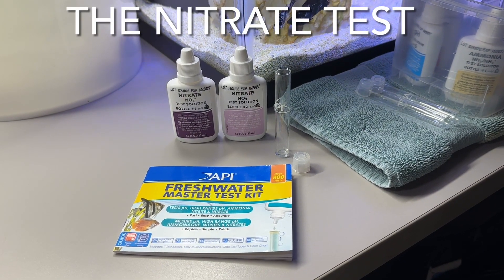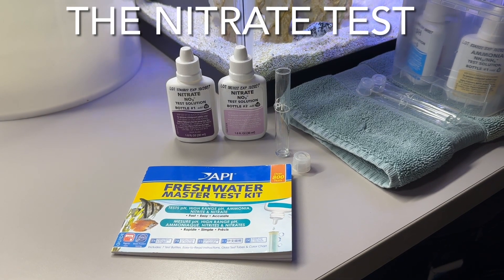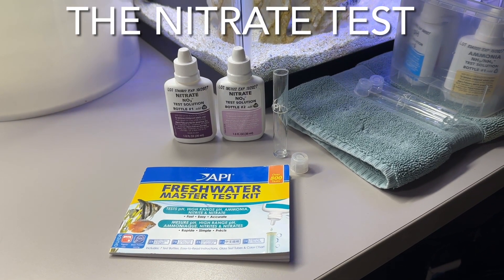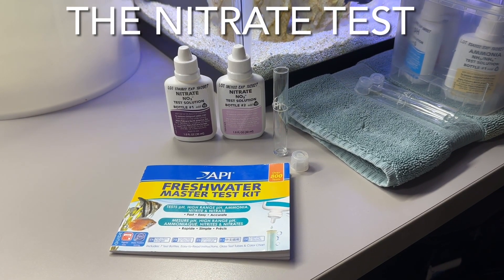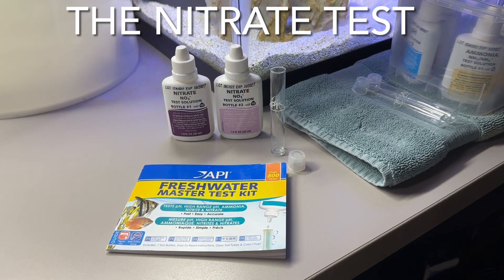This is how we do the API freshwater master test kit for nitrate. This test has a couple of extra steps that are important, so let's get into it and show you how to do it correctly.